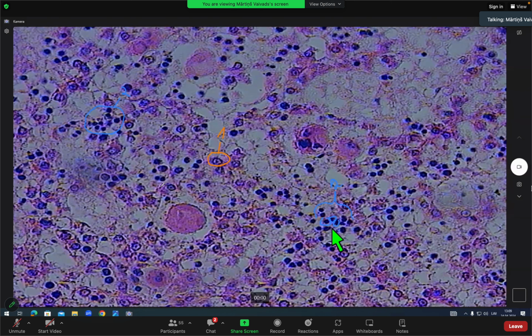It happens very actively during the second trimester. And closer to the end of the third trimester, new blood cells start to develop more within the bone marrow cavity. So red bone marrow appears much later. But first, in the liver, a lot of new blood cells develop, specifically here. And because new blood cells are developing, you will see another cell.